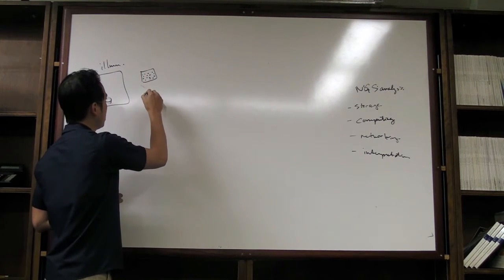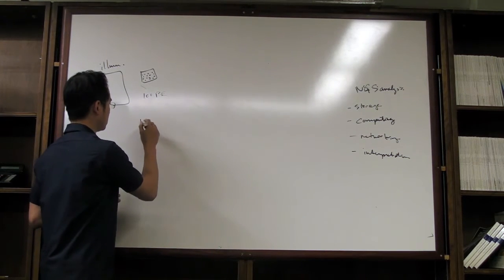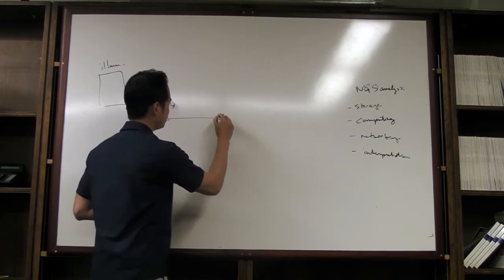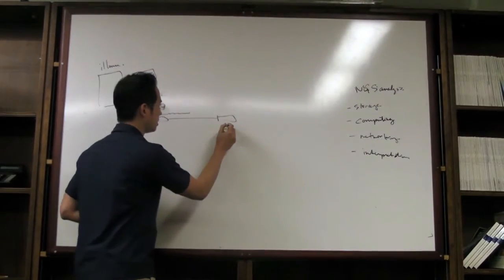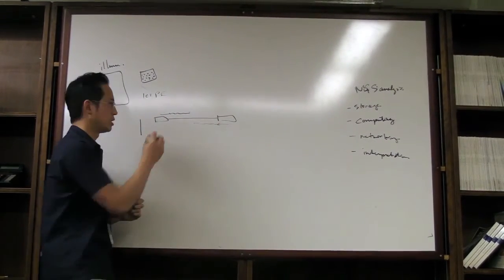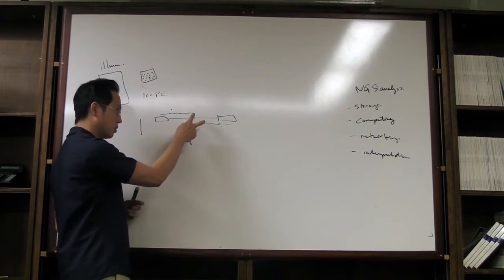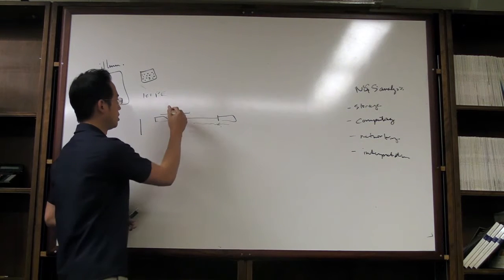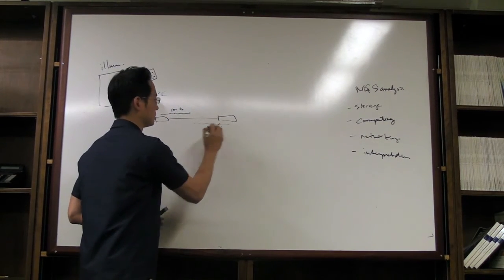You can do, say, a 100 paired-end run. What this means is that you sequence your fragment in one direction, and then you take that away and sequence in the other direction. So you get a paired end, where the two ends are paired together. It's actually 2 reads, but they are paired reads, and we do 100 bases on each side. That's what 100 paired-end means.